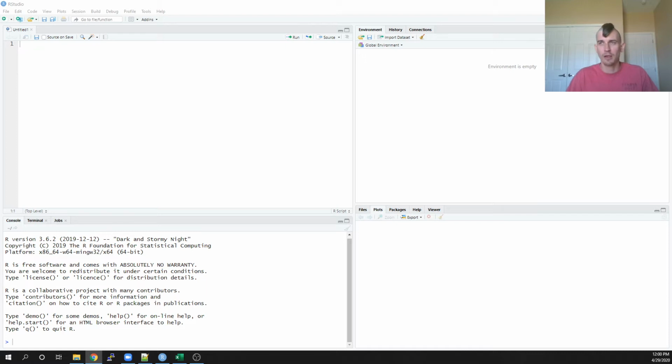Who knows? Hopefully, you've at least installed these packages from the installation script that I ran. If you had any problems with that one, let me know. But I'm just going to start building stuff out and explain what I'm doing and also a little bit of what's happening behind the scenes.